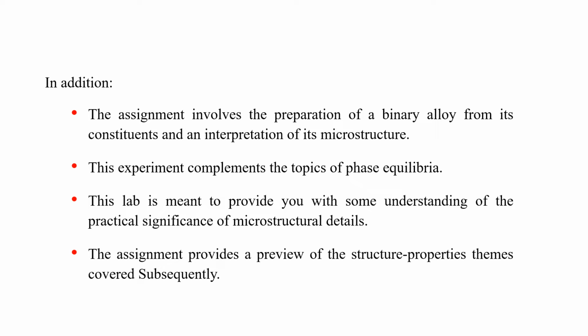In addition, the assignment involves the preparation of a binary alloy from its constituents and the interpretation of its microstructure. This experiment complements the topics of phase equilibrium. This lab is meant to provide you with some understanding of the practical significance of microstructural details. This assignment provides a preview of the structure-properties themes covered subsequently.